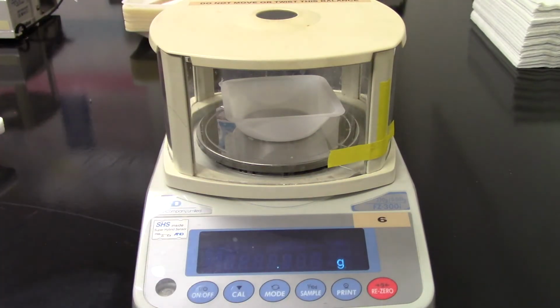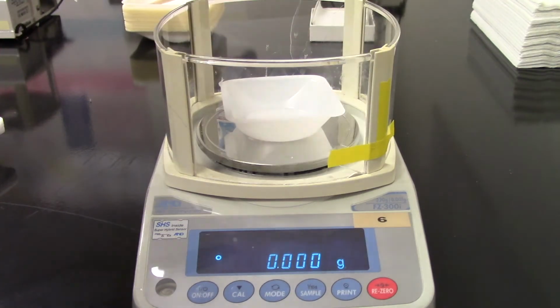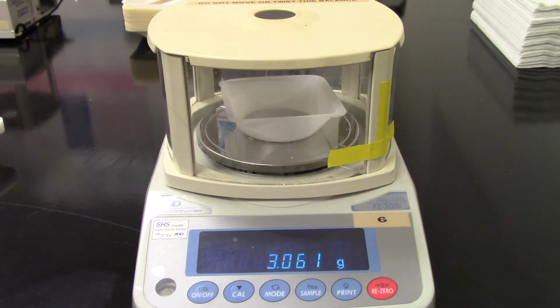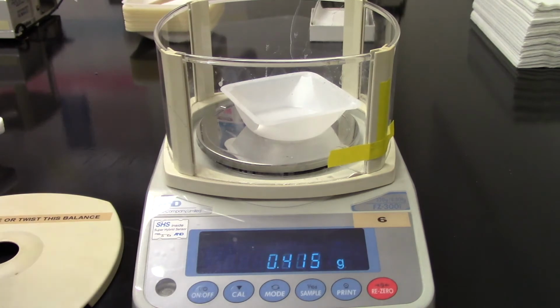Let's re-zero it. This penny is 1974. This penny is 1989.